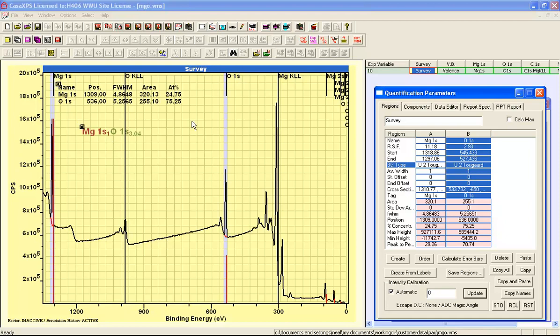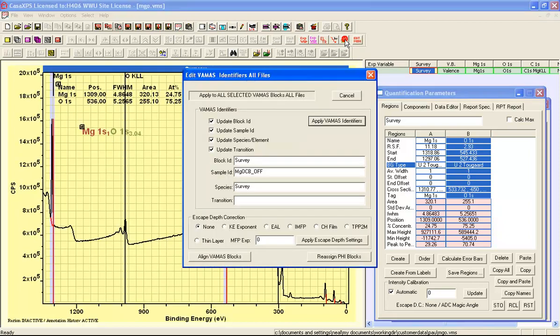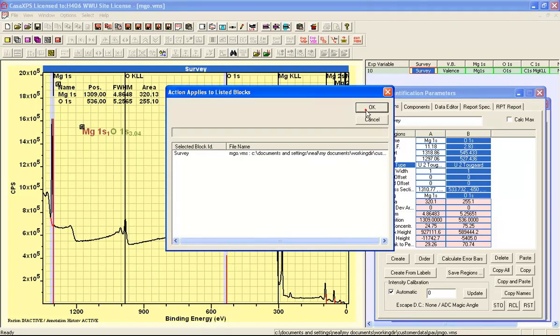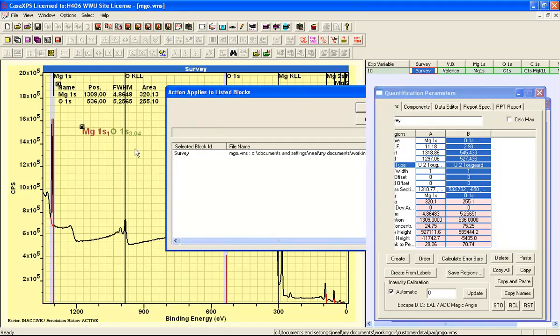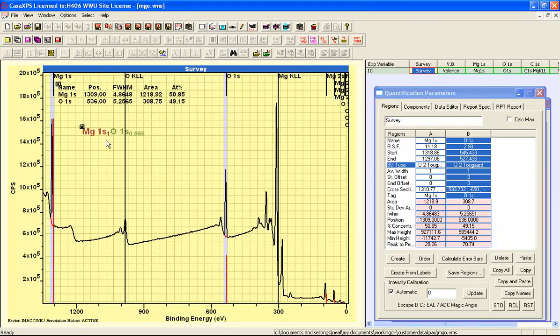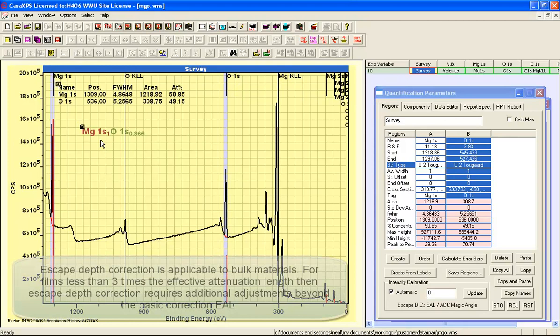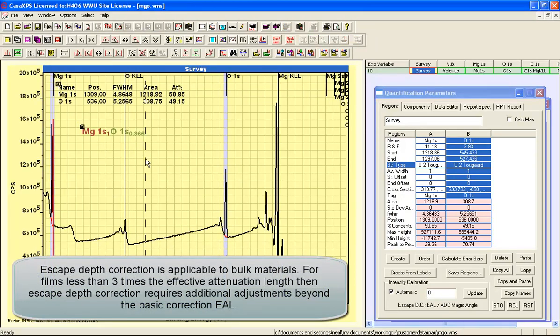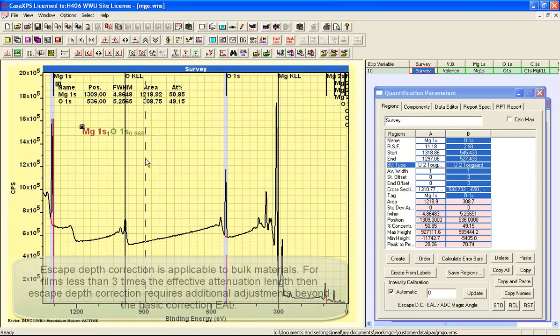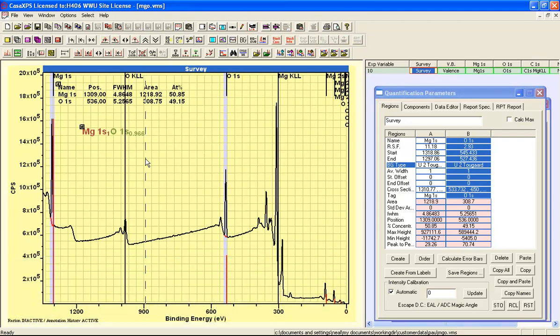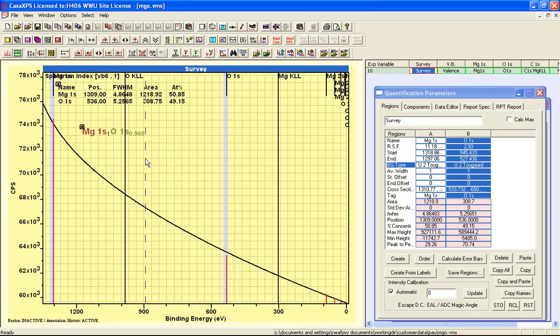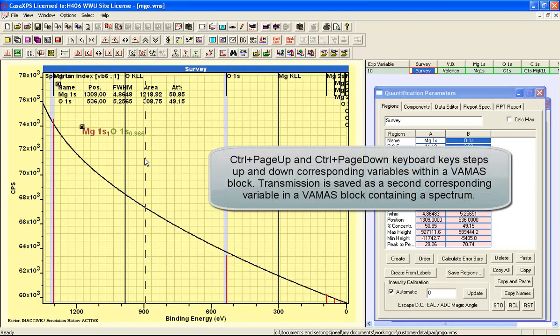And it's not until I add the escape depth correction of the effective attenuation length that the relationship then looks like 1 to 1. So the transmission function, if I do control page up, you can see the nature of the transmission function that's been added to these data.